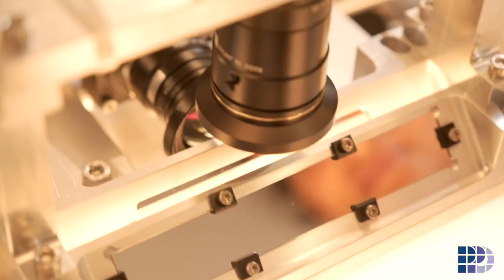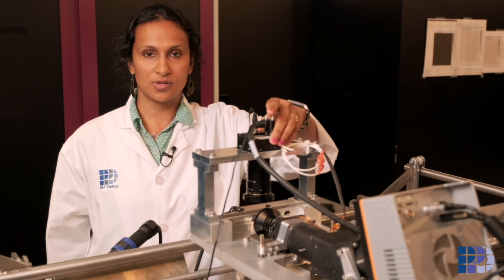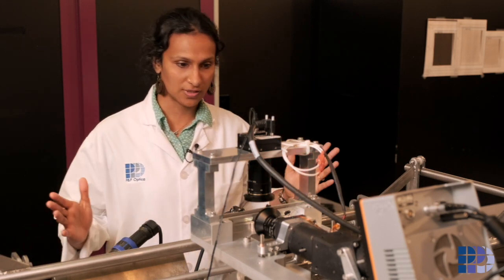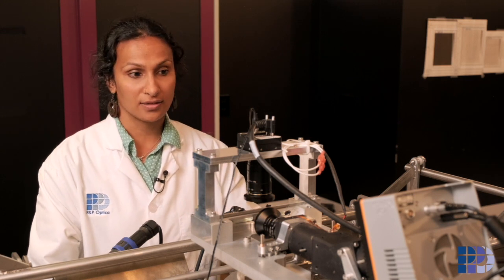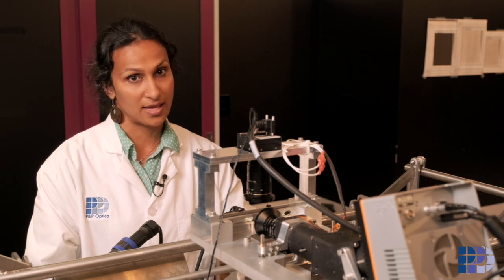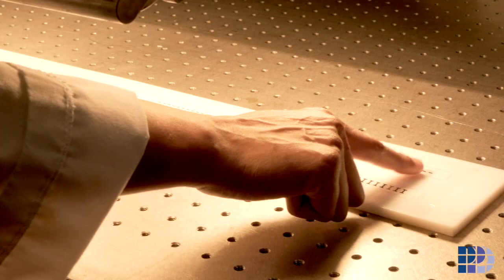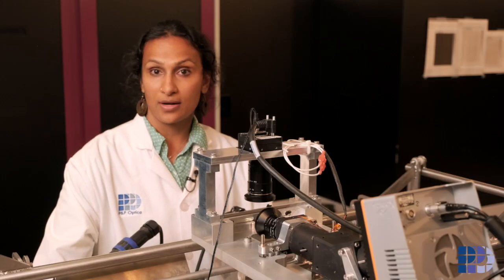So we have two mirrors here which are specifically coated such that this visible camera receives visible signal, and the spectrometer receives the infrared region of the signal. So the next step is to ensure that the visible camera and the spectrometer are looking at the same object, that is the same scan line. To start that, here is the target with dotted lines, and it is set up on the table such that it is going to be parallel to the belt.